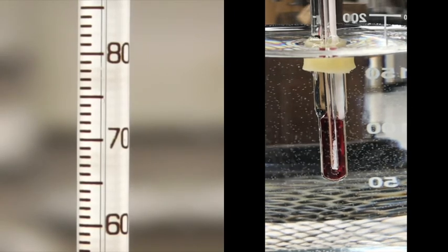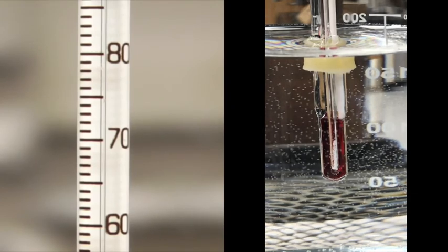Right, so we're running just below 50 right now, so we'll let it heat a little bit here, and then we will slow the heating down once we get up above 60. Alright, we're just going above 50 right now.